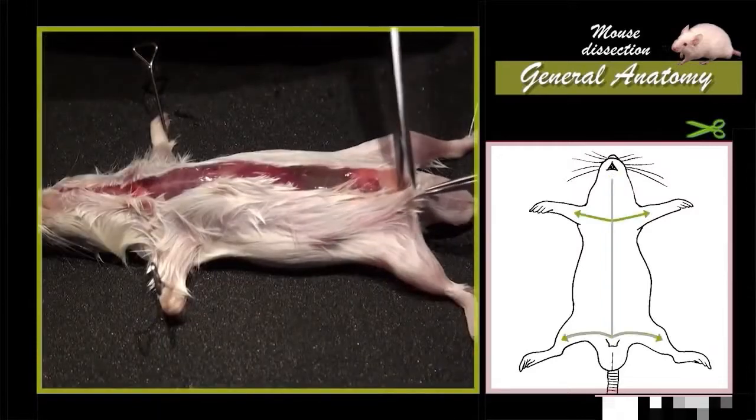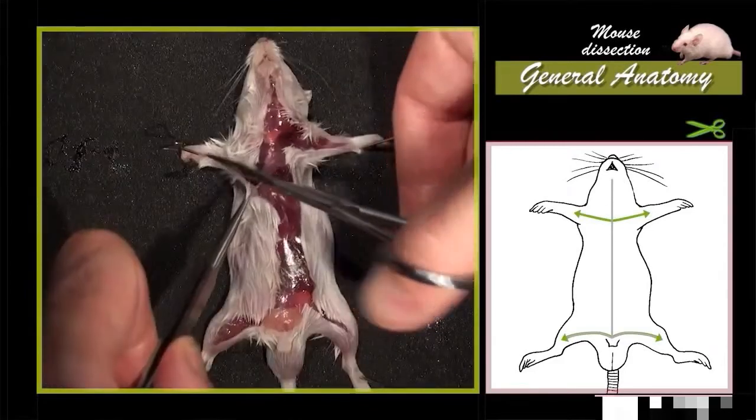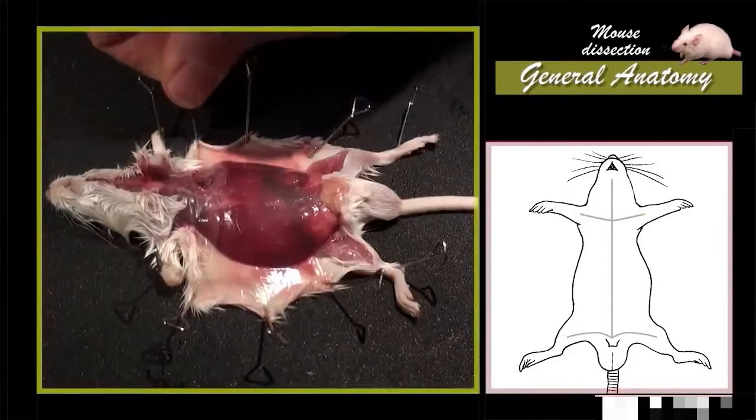Two lateral incisions extend towards the extremities of forelimbs and hind limbs. The skin is separated from the underlying muscular layer and pinned on the sides.